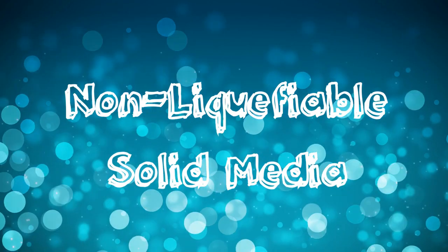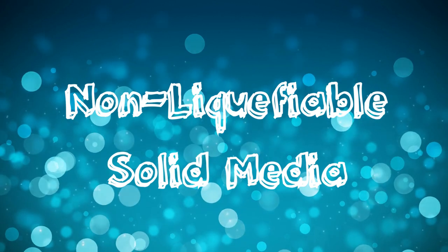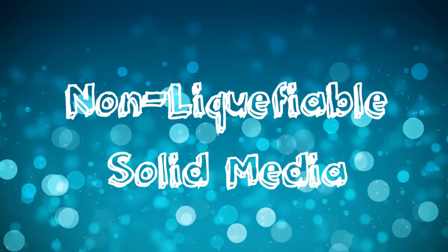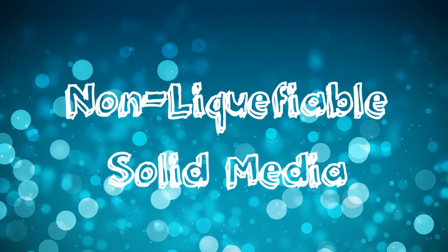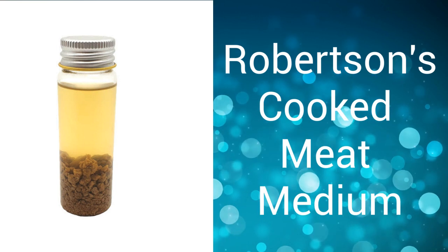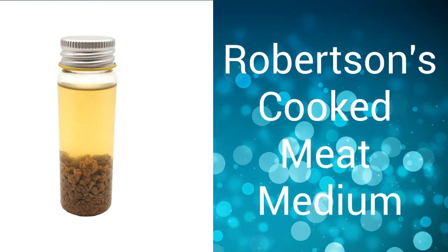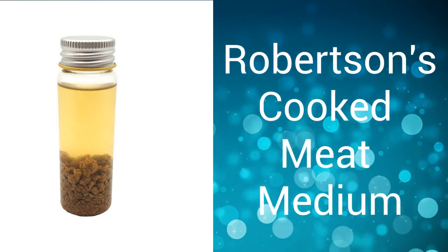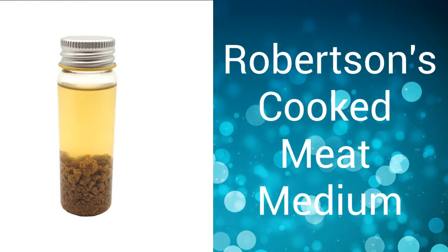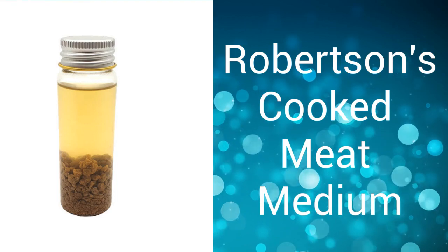Non-liquefiable solid media are less versatile in their applications than agar media because they do not melt once solidified. They include cooked meat media used for the cultivation of anaerobes. They start out liquid and get permanently coagulated and hardened by moist heat after sterilization.